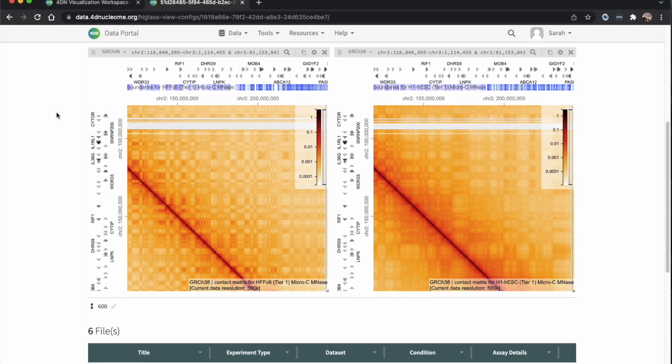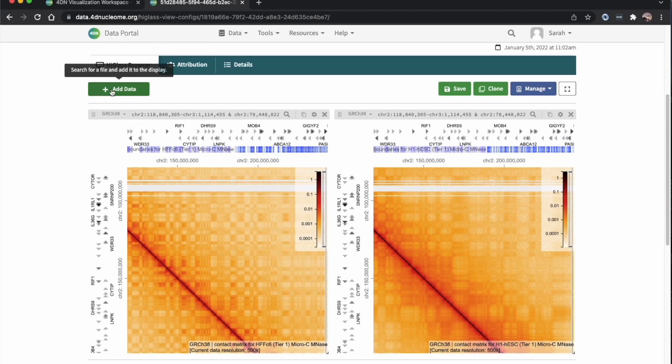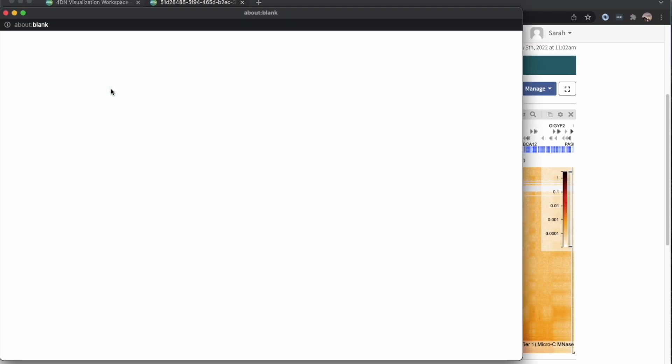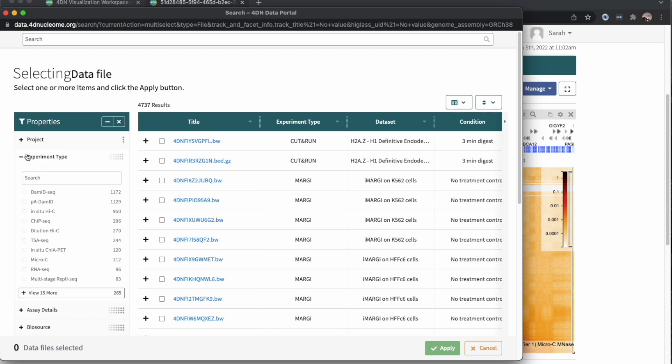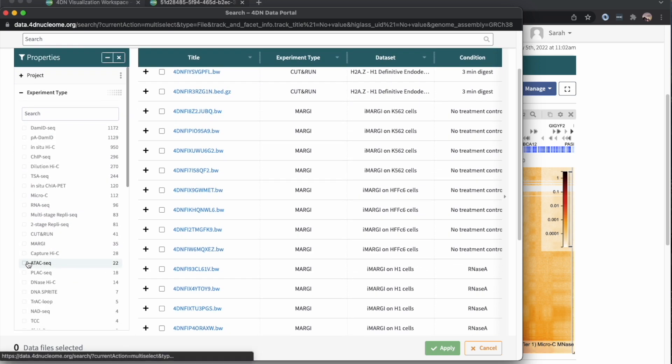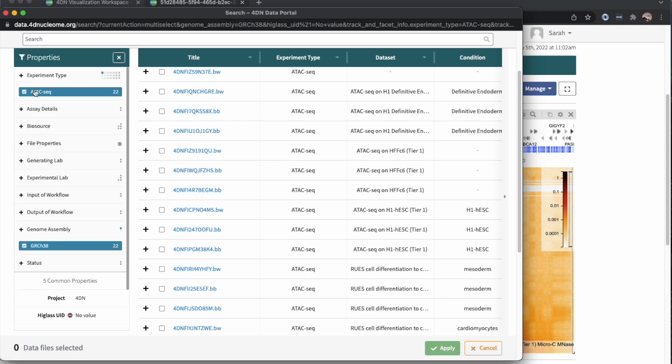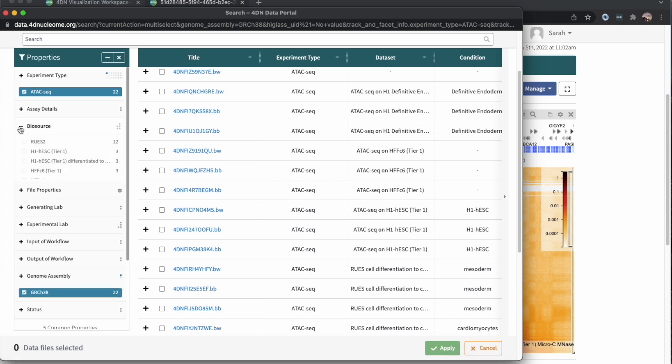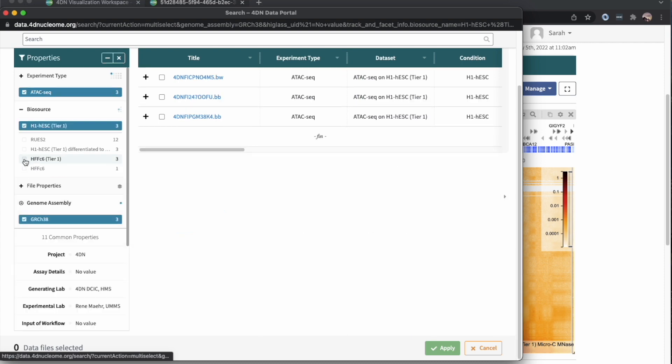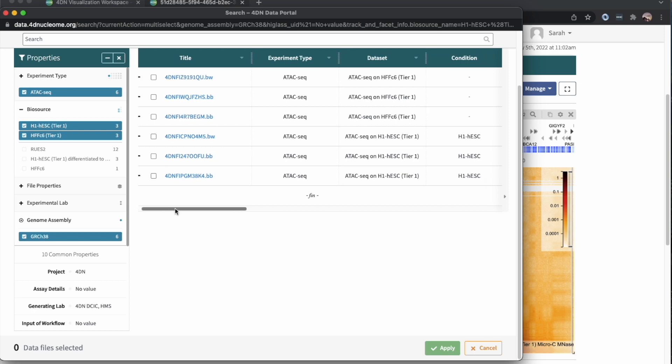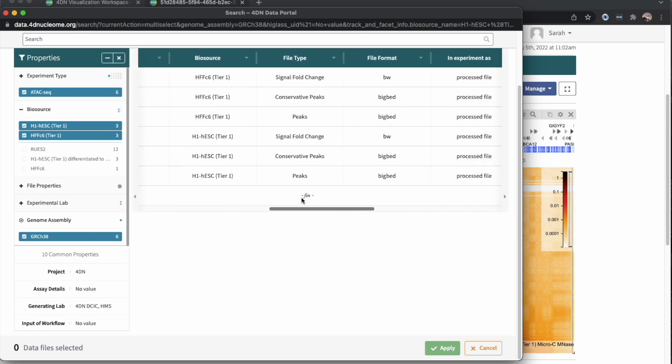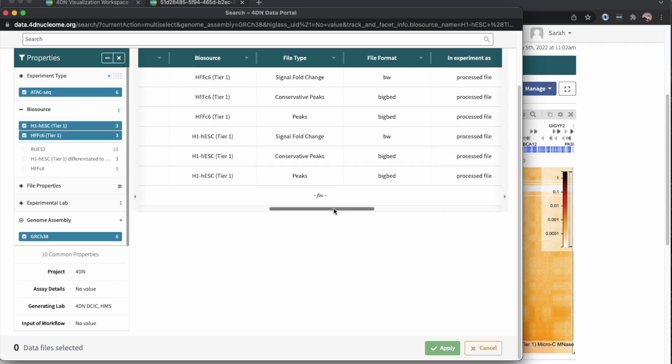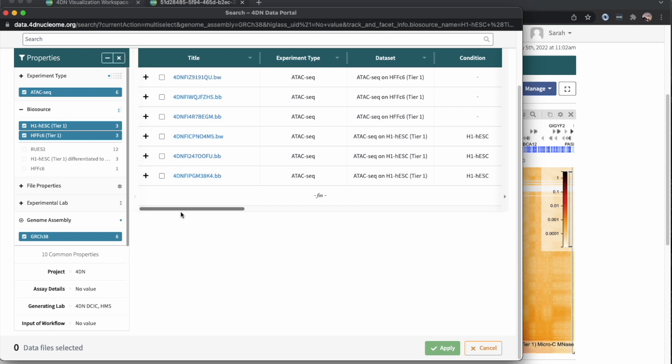At this point, maybe we want to look at different types of experiments besides just micro-C. So we can add more data. Right now I'm going to click on ATAC-Seq to look at chromatin accessibility, and I'll use the same biosources as before. Now we have six files, so we can scroll over and look at what these files are. We have signal-fold change, conservative peaks, and peaks. I'm going to look at signal-fold change and click on the HFF and the H1.